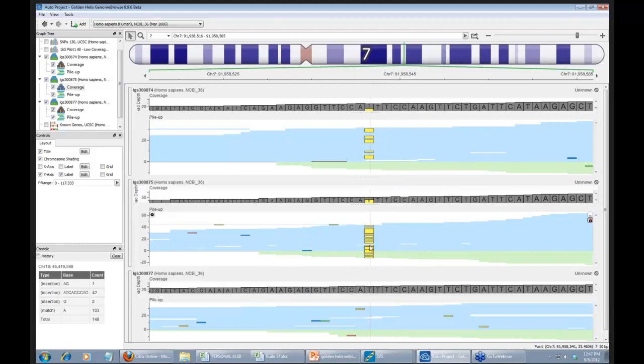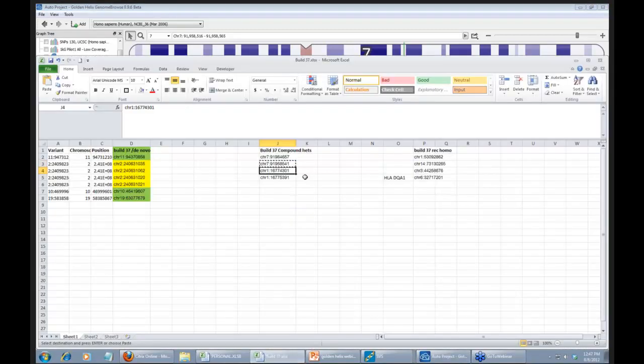This parent definitely looks heterozygous. This one looks homozygous. And if you remember from the first SNP I showed you, it was flipped around as far as which parent had the polymorphism. So this is actually a very good candidate. It fits the model and it fits the description of what we're looking for. Let me show you another candidate on chromosome 1.